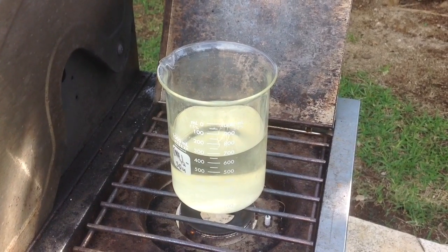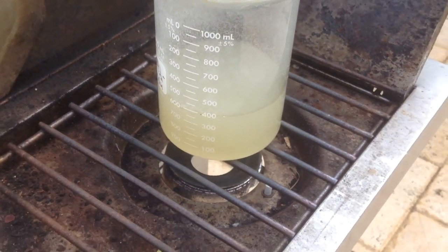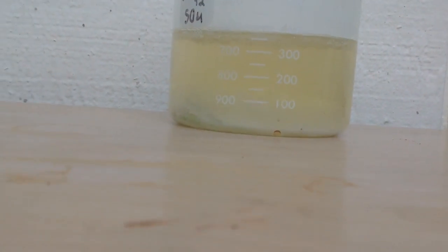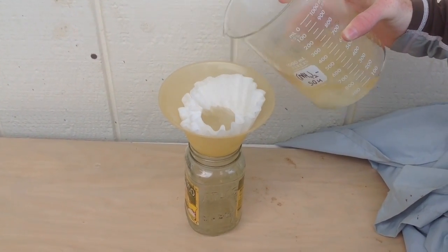Once you have filtered the mixture, the next step is to boil down the solution until crystals start to form on the top. In my case, I evaporated 250 milliliters. Then take it off the heat and let it cool down. Next, filter the solution and retrieve your ammonium sulfate crystals.